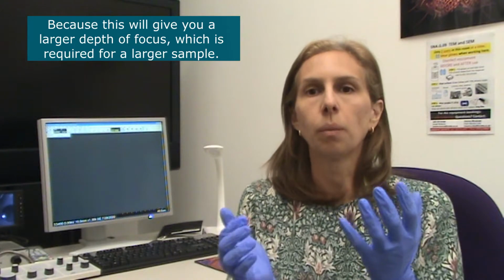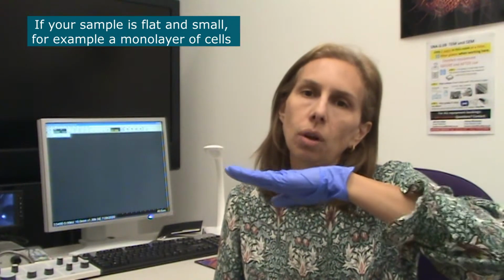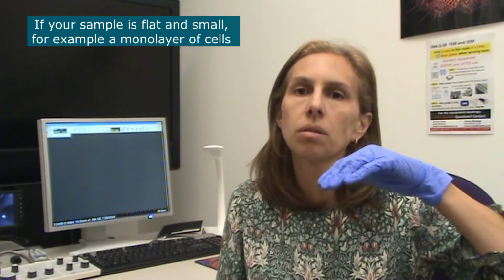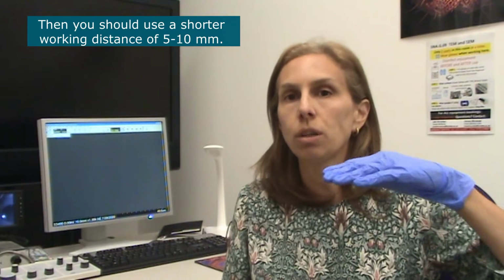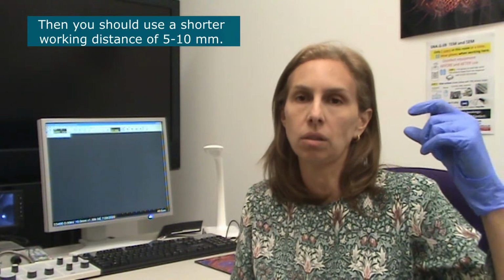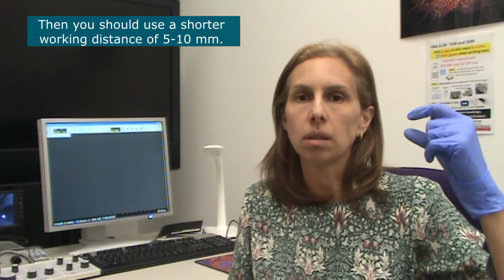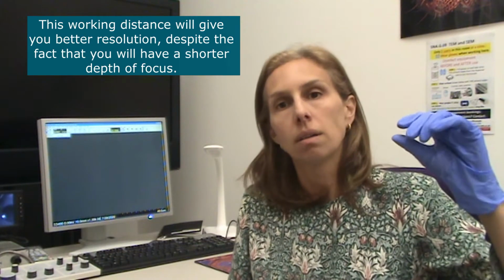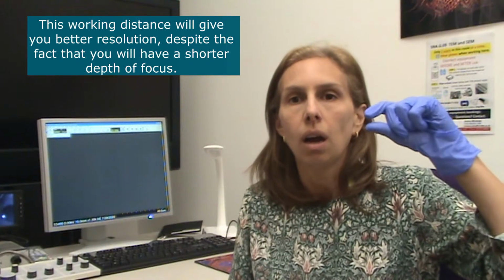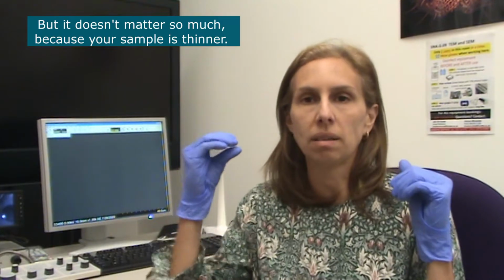which is required for a larger sample. Now, if you have a sample that's quite small, let's say you have a monolayer of cells, these are quite small, flat samples, then you will be willing to use a shorter working distance of say less than 10 millimeters, 5 to 10 millimeters. That working distance will give you better resolution, despite the fact that you have a smaller depth of focus, but that doesn't matter so much because your sample is thinner.